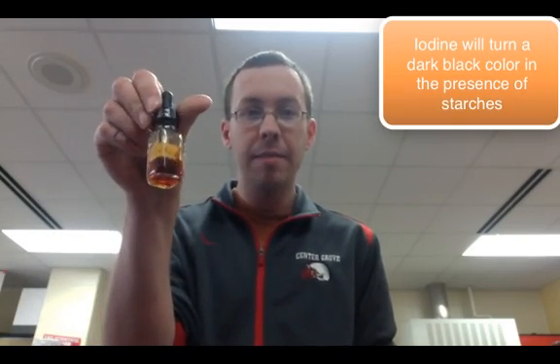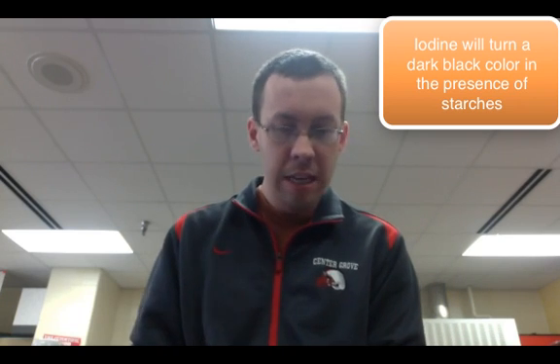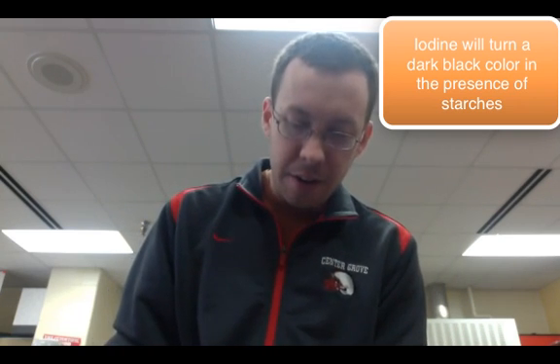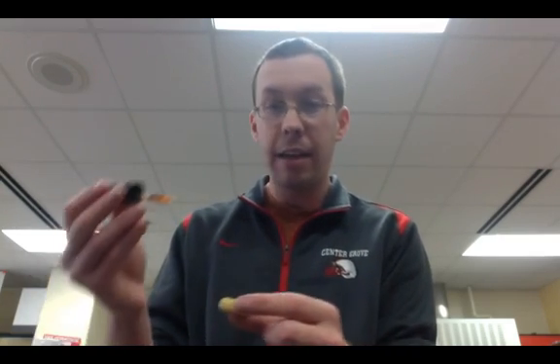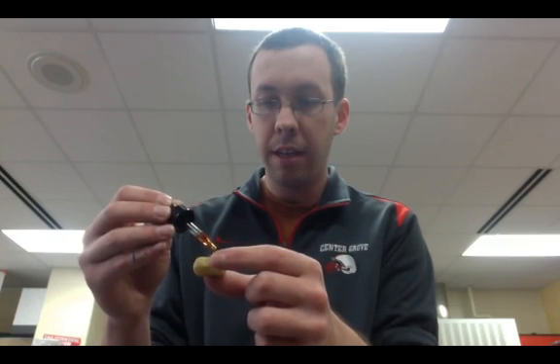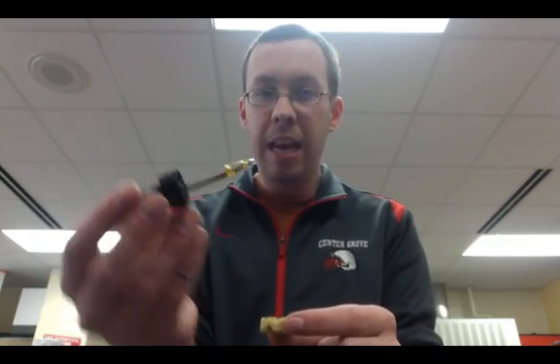The first one I want to look at is carbohydrates. How do we test for carbohydrates? I've got a piece of a crouton here and I've got some iodine. Iodine allows us to test for carbohydrates — it actually turns a blue-black color if starches or carbohydrates are present. So if I take a couple drops of this iodine solution and place it on here, you can see it's kind of an orangey brownish color. But when I place it on the crouton, you can see that it turned a very dark black or even blue color. That tells us that this tested positive for starches and carbohydrates.